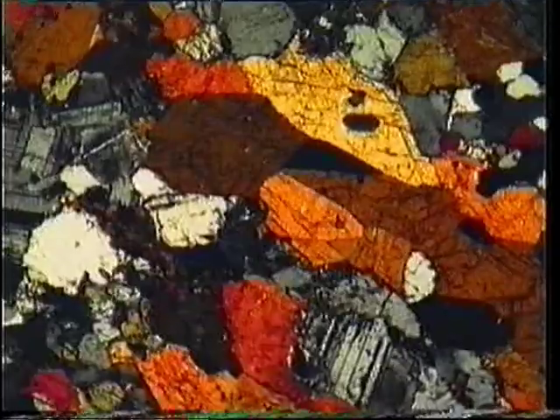The transverse prism sections with two directions of cleavage are characteristic of amphiboles. Inclined extinction suggests a clinoamphibole, and strong colour and pleochroism indicate green hornblende. Usually, mineral identification doesn't need all these properties to be determined.